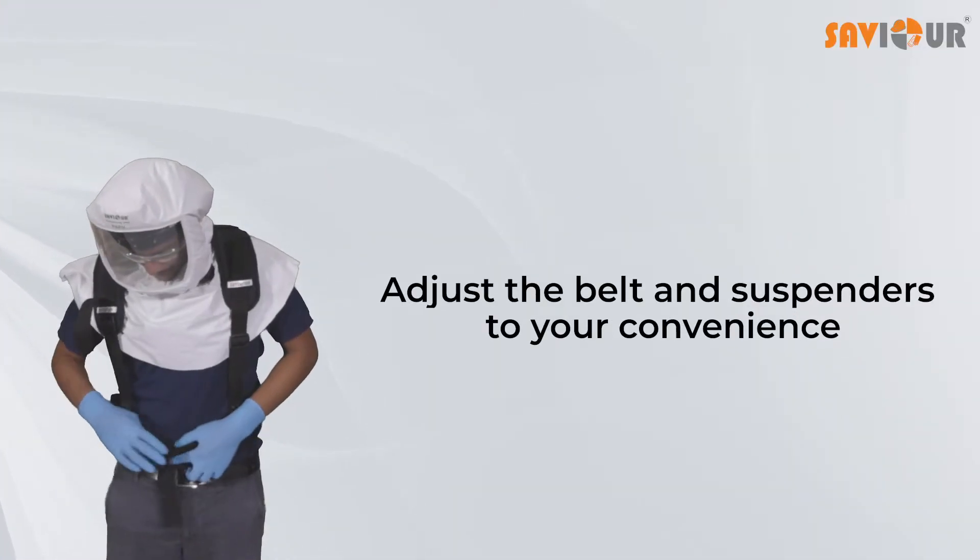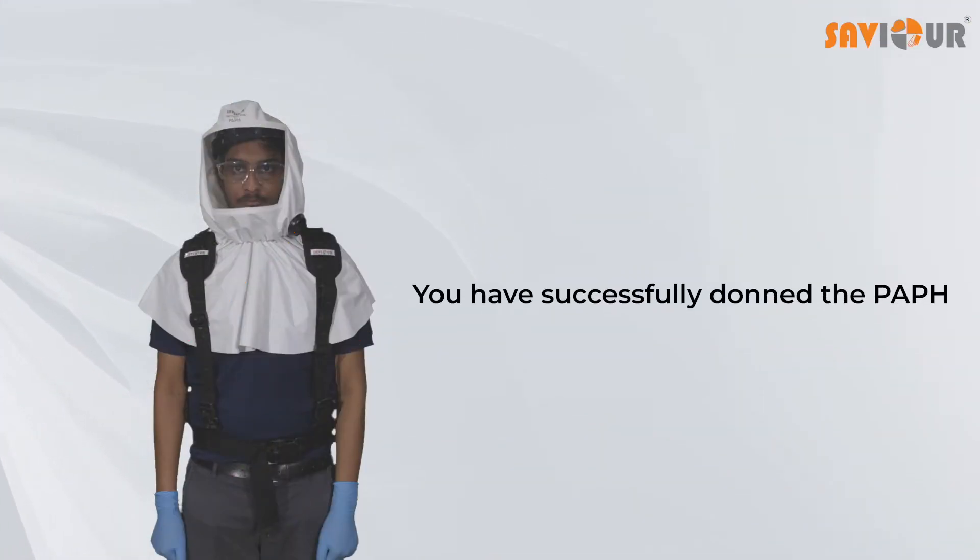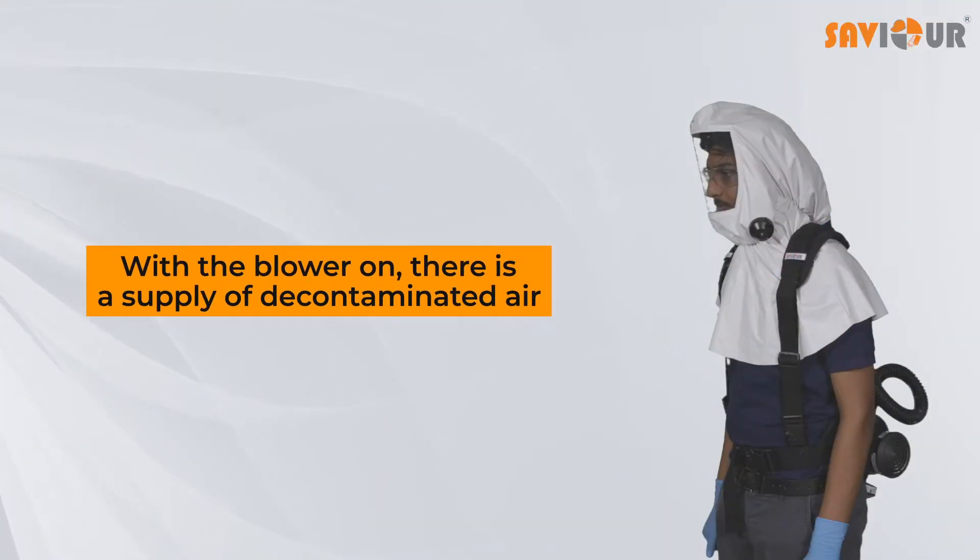Adjust the belt and suspenders to your convenience. You have successfully donned the PAPH. With the blower on, there is a supply of decontaminated air.